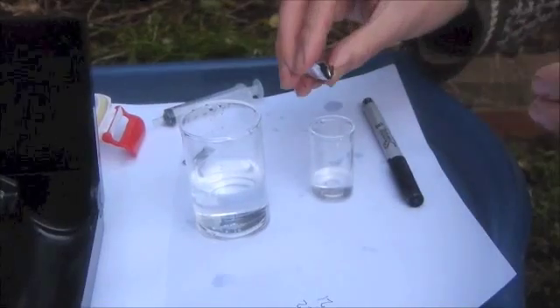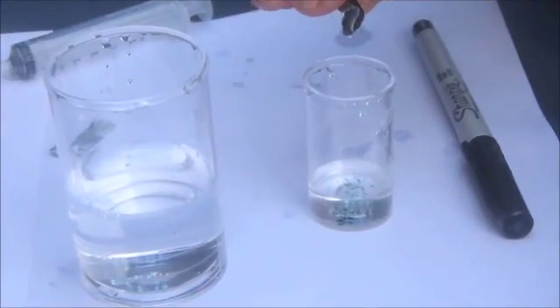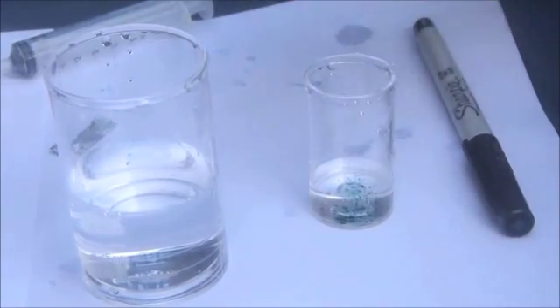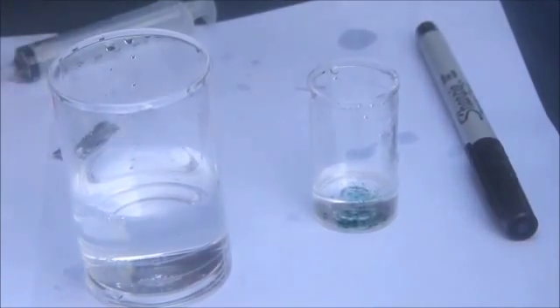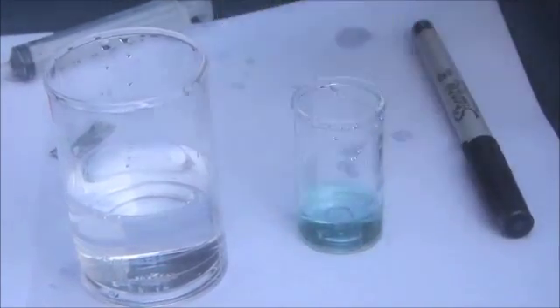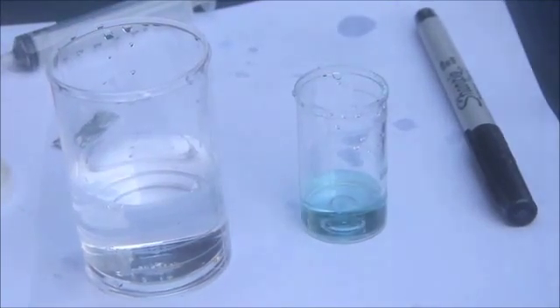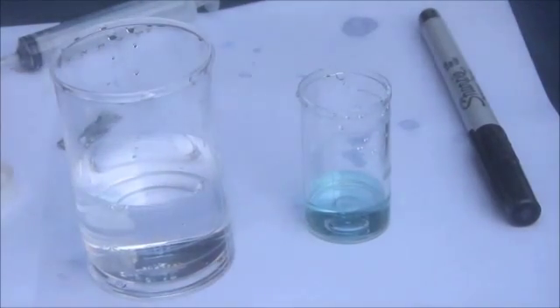got our water sample here, and we simply add a bit of the powder. Not too much, because there's quite a lot in there actually. Give it a little shake. And this particular indicator turns green when it's above pH 4.3, not blue. But the procedure is just the same.